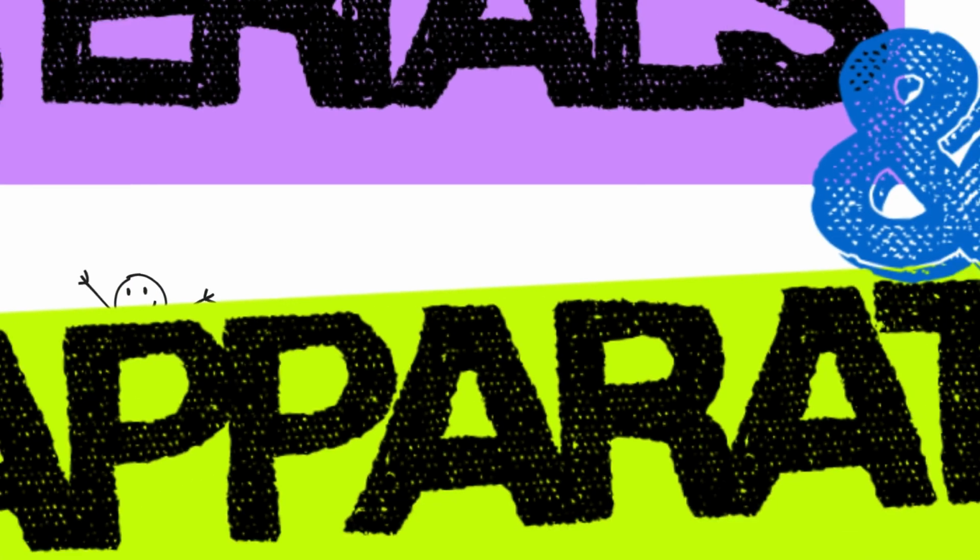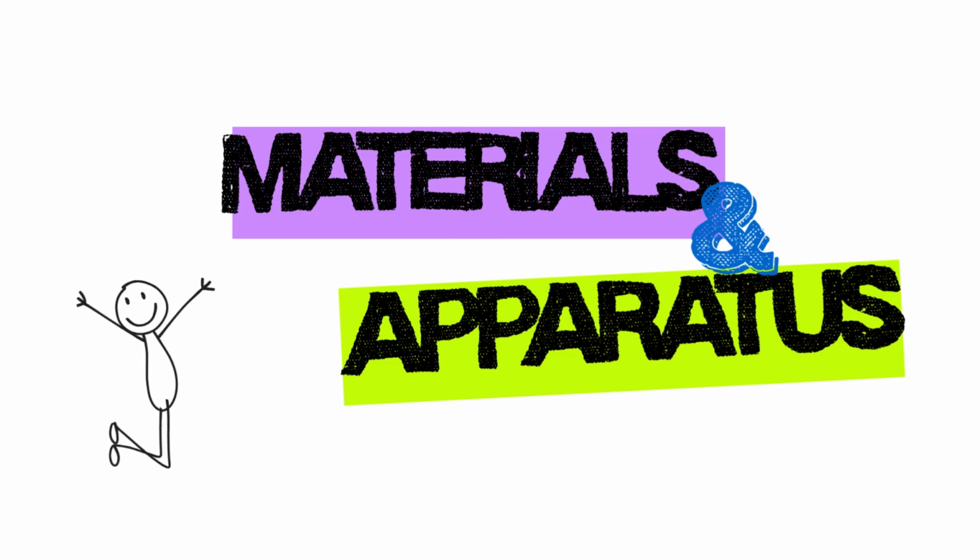So here are the materials and apparatus that you'll need to prepare before conducting this experiment.